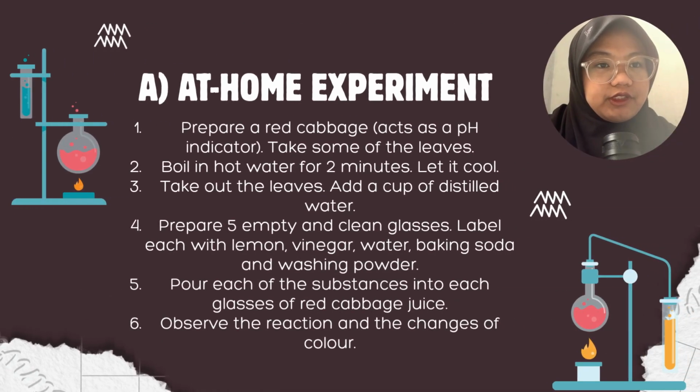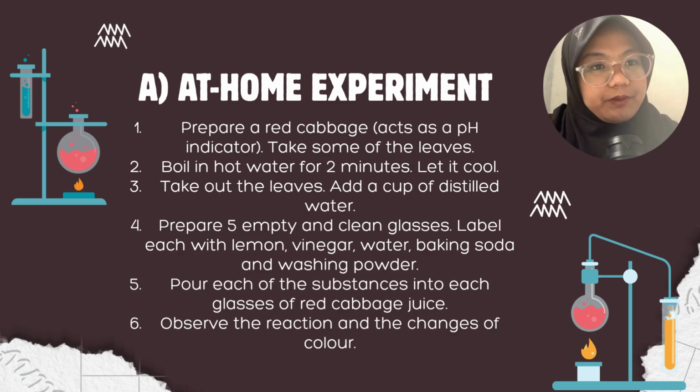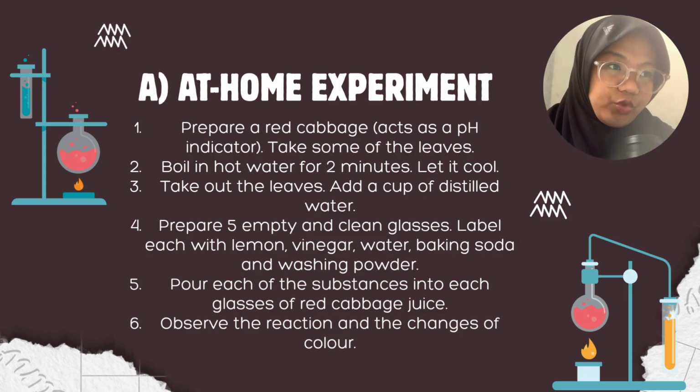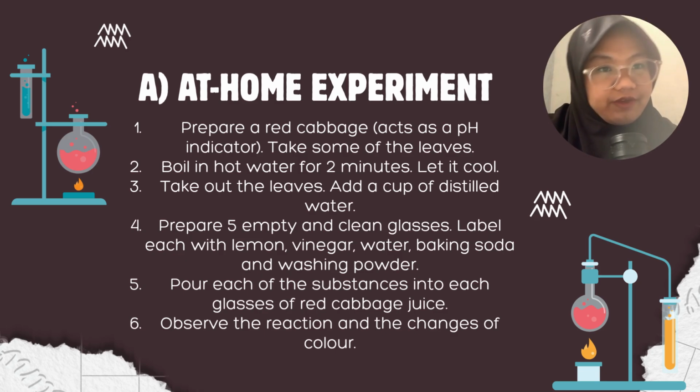Alright, so right now we are talking about methodology. So we have A, which is the at-home experiment. At-home experiment means that you can easily do the experiment inside your house, or maybe the ingredients are easily found in the kitchen, or maybe you can buy it from the store, get it from the supermarket and so on.